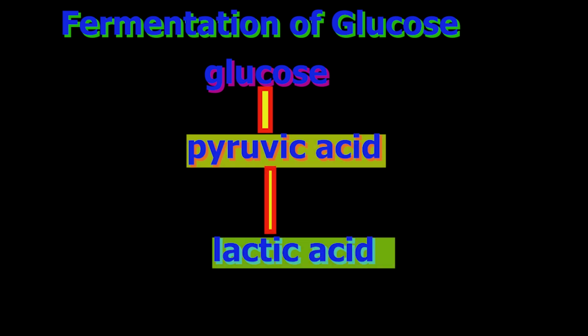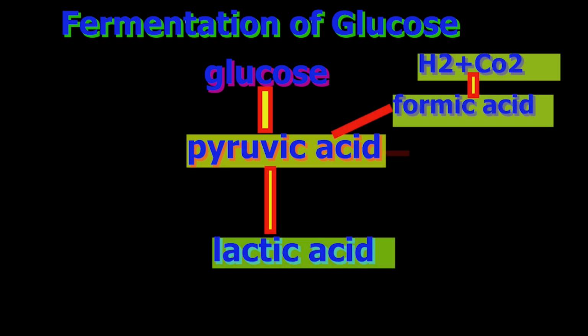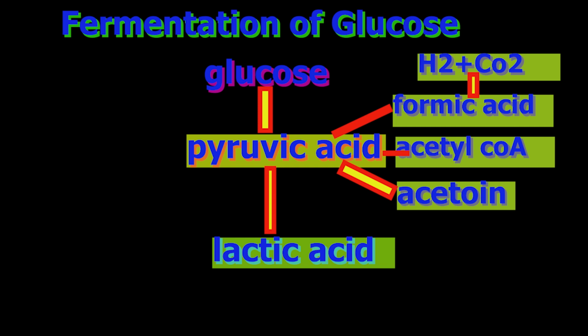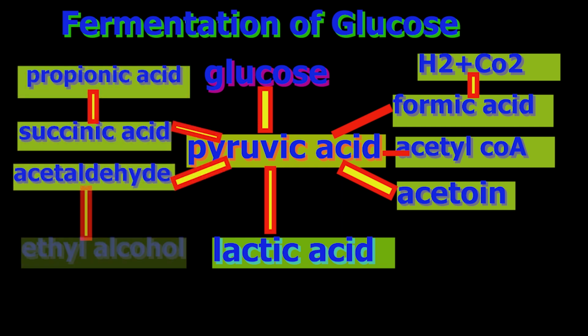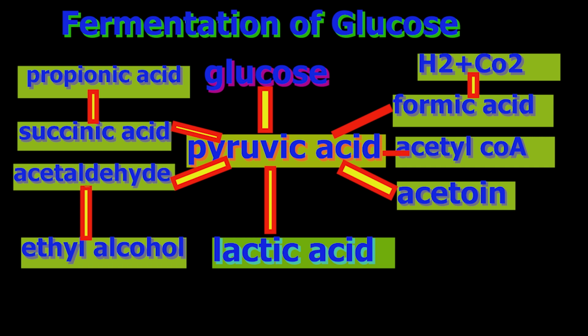Carbohydrate utilization. Bacteria are differentiated by the carbohydrates they metabolize and the types and quantities of acid produced. The gas produced from fermentation is a mixture of hydrogen and carbon dioxide formed through the cleavage of formic acid.